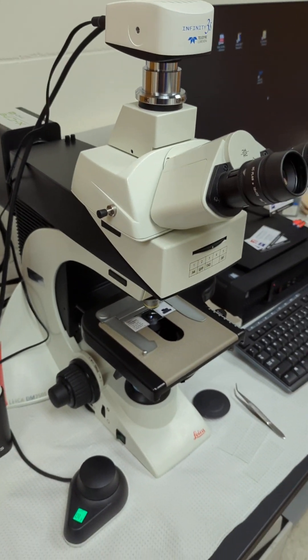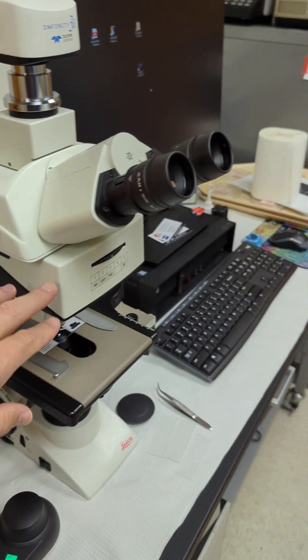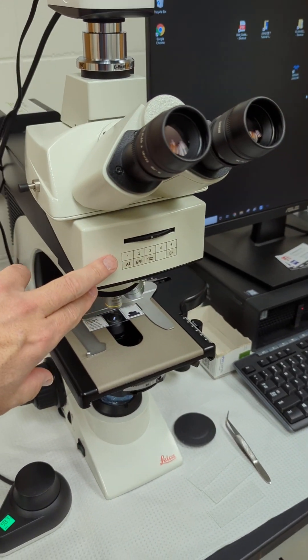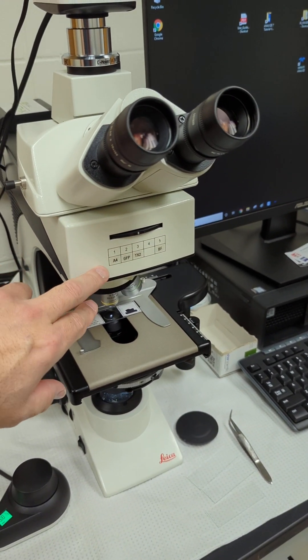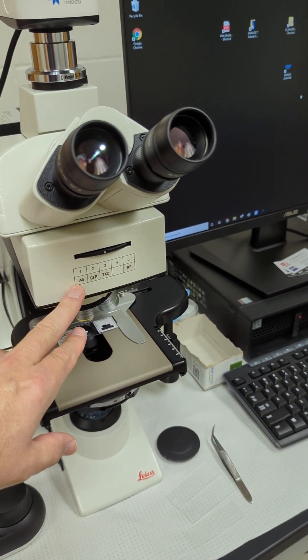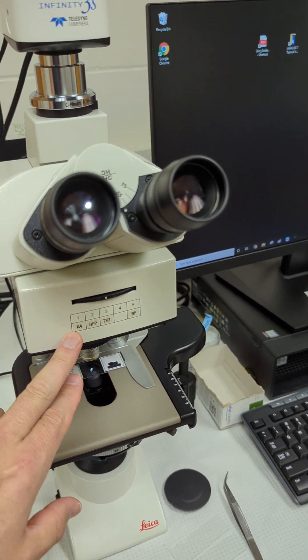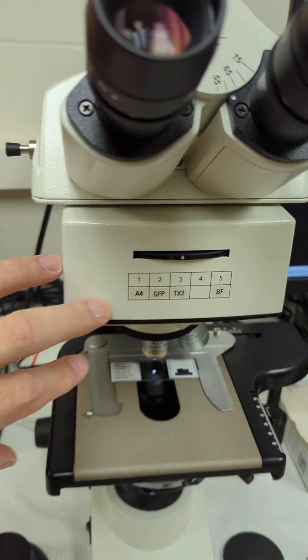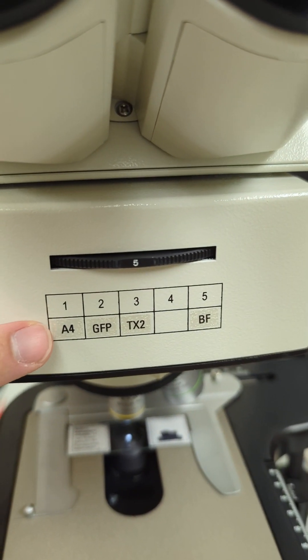As we come down here, you have your filter cubes which are in here, and you've got a DAPI. Let me focus in on those.